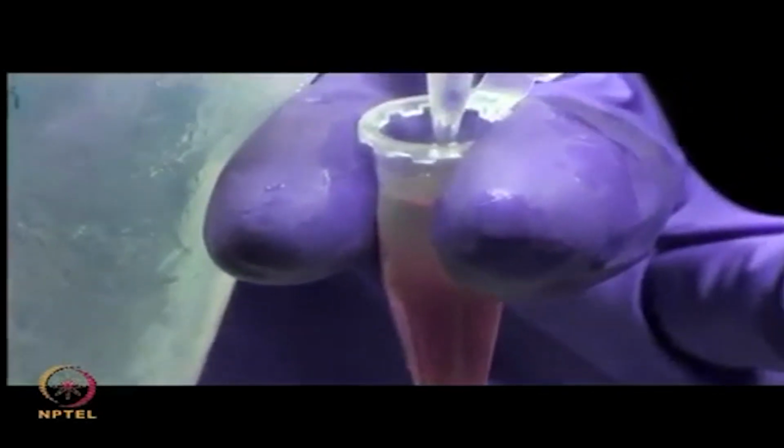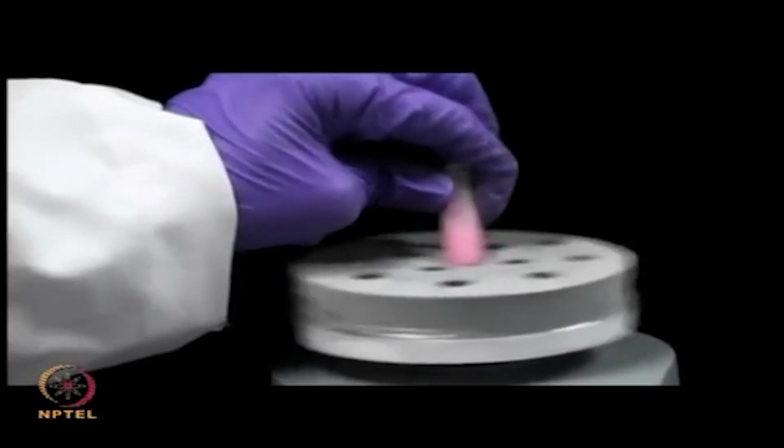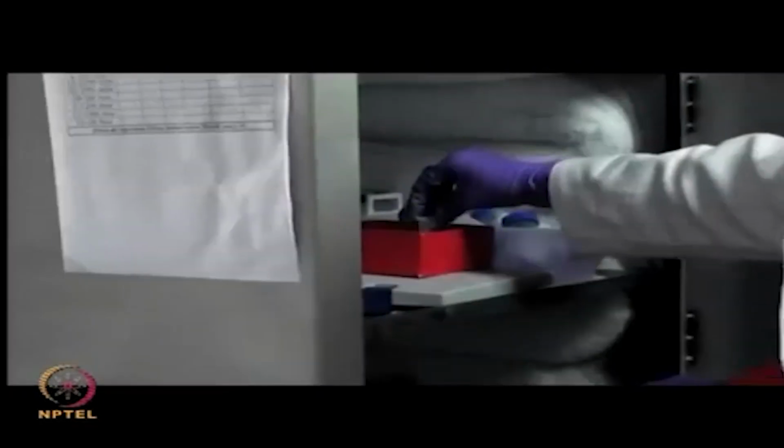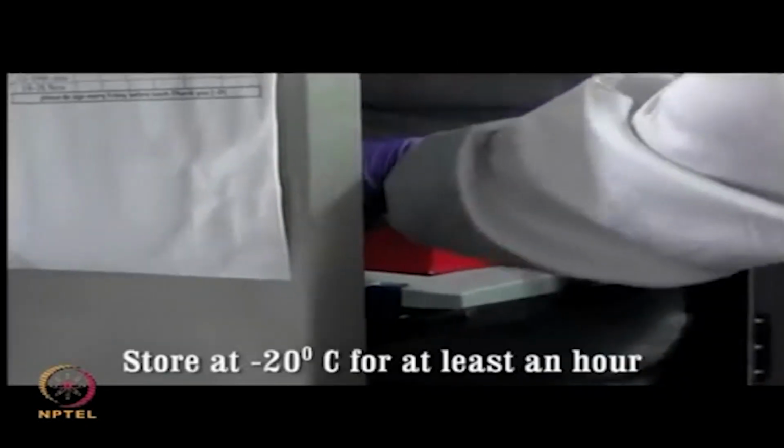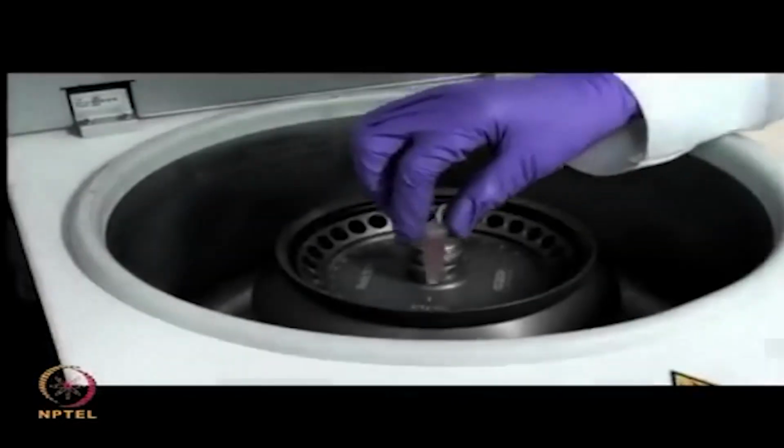Then, add chilled acetone to this tube and mix well by vortexing. Store this solution at -20°C for at least an hour before centrifuging it to obtain the protein pellet.